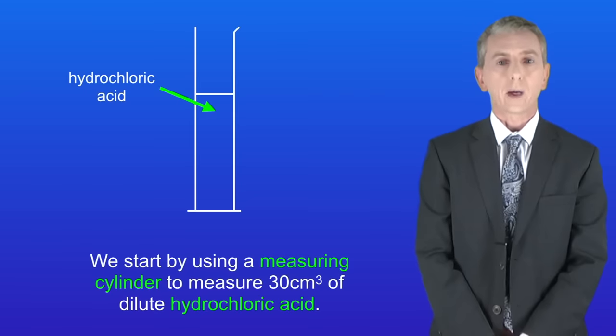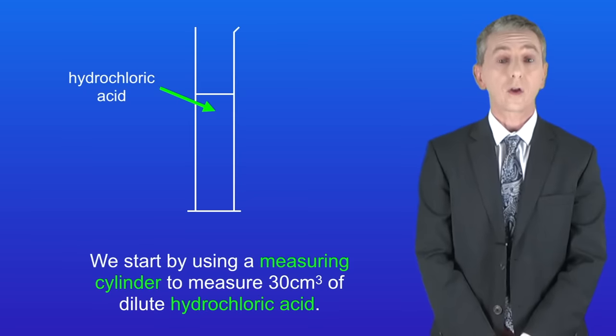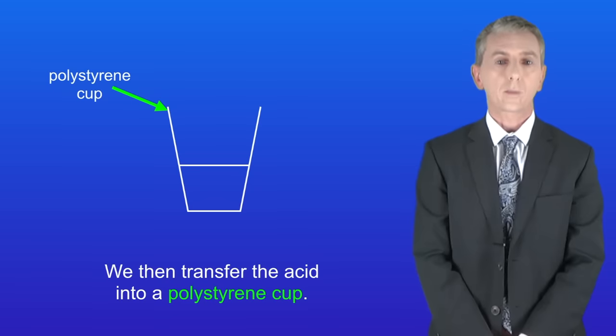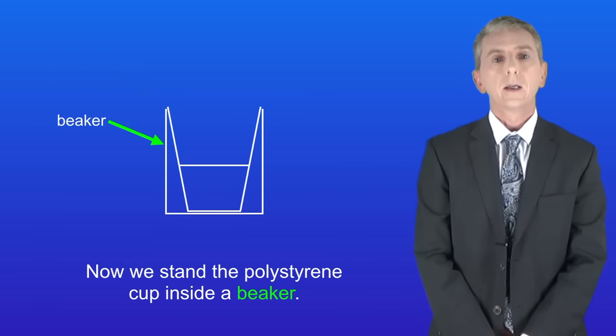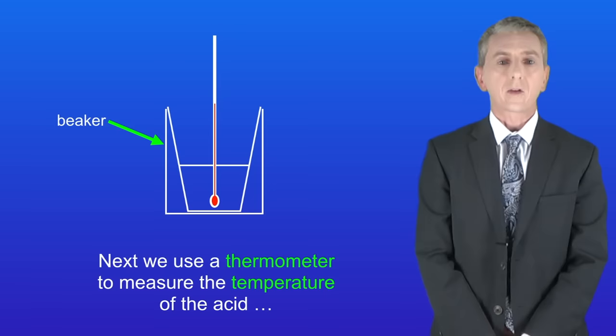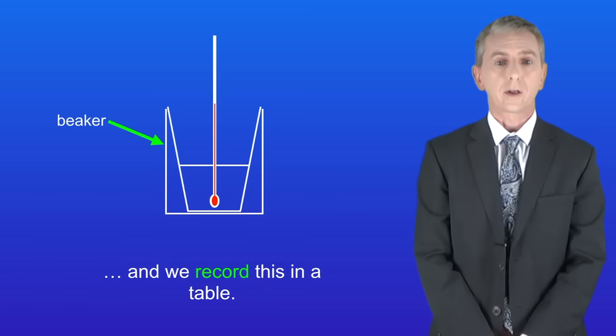We start by using a measuring cylinder to measure 30 centimeters cubed of dilute hydrochloric acid. We then transfer the acid into a polystyrene cup. Now we stand the polystyrene cup inside a beaker and this stops the cup from falling over. Next we use a thermometer to measure the temperature of the acid and we record this in a table.